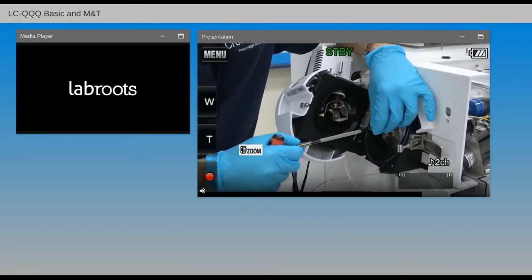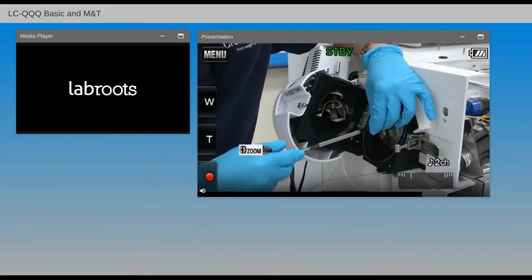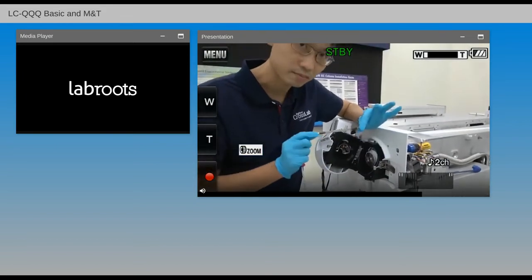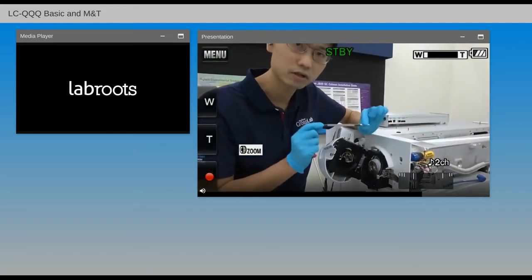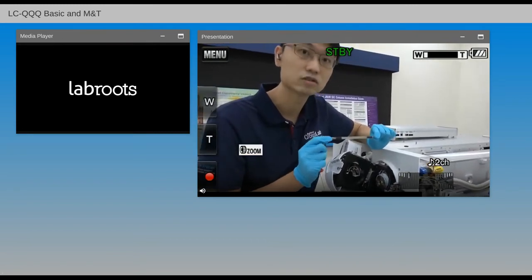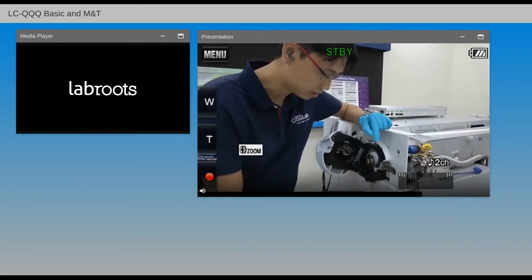You can take a look at the video at your own time. That allows you to remove the capillary without a full vent. So this is one of the most important consumables to sample the ions in the first pass. Okay, so I shall leave this here.